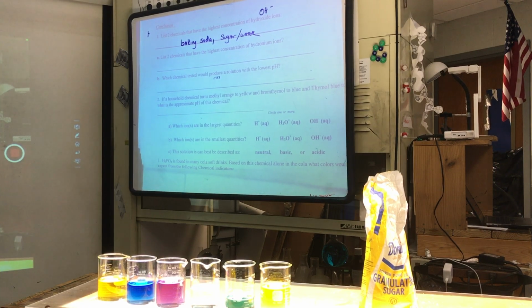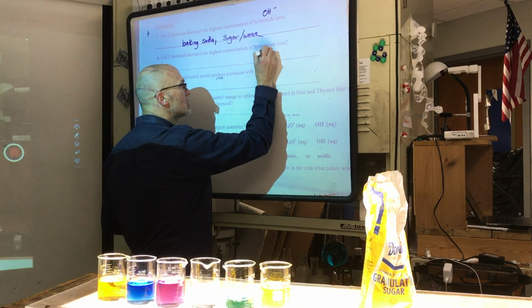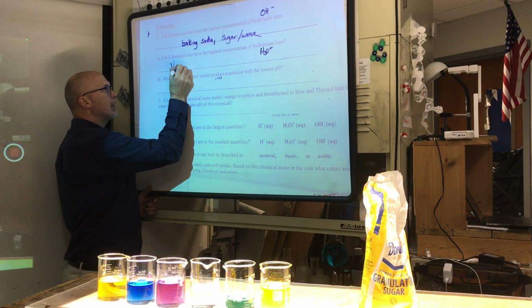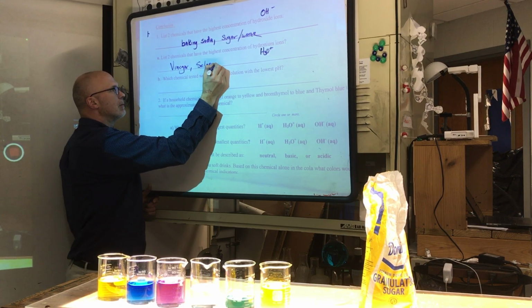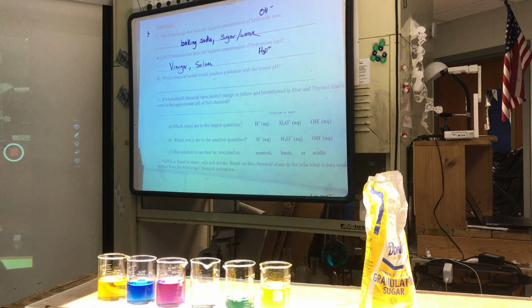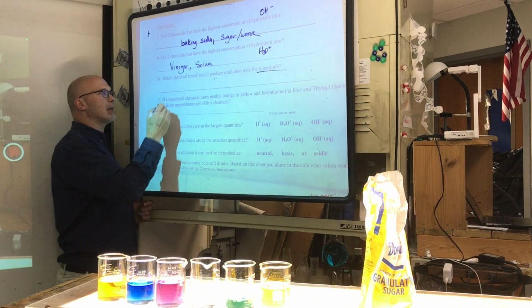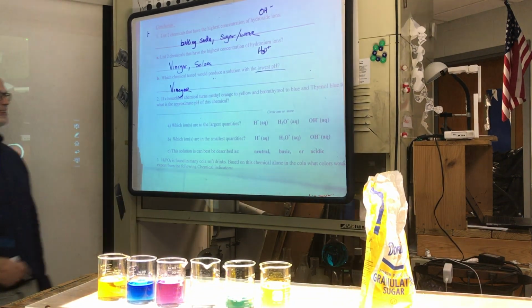Who had the highest concentration of hydronium? It sounds like hydroxide, but it's not. It's H3O+. So what am I really asking? Who was the most acidic? Vinegar and seltzer water. Which chemical tested would produce the lowest pH? Lowest pH, lowest number, most acidic. Vinegar. You got me saying that now. It's so fun.